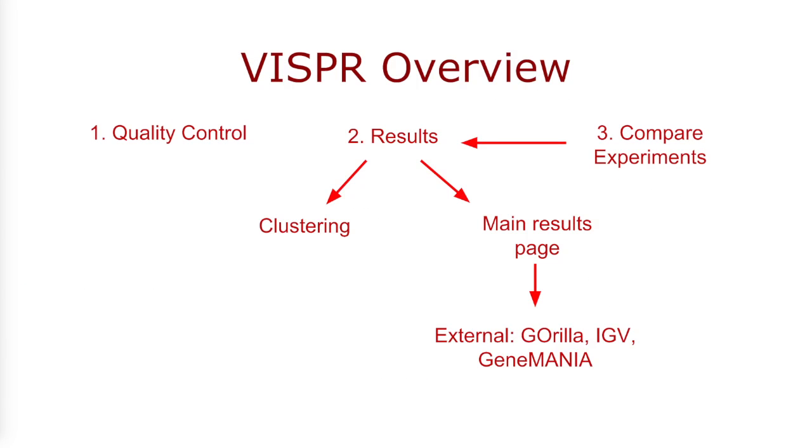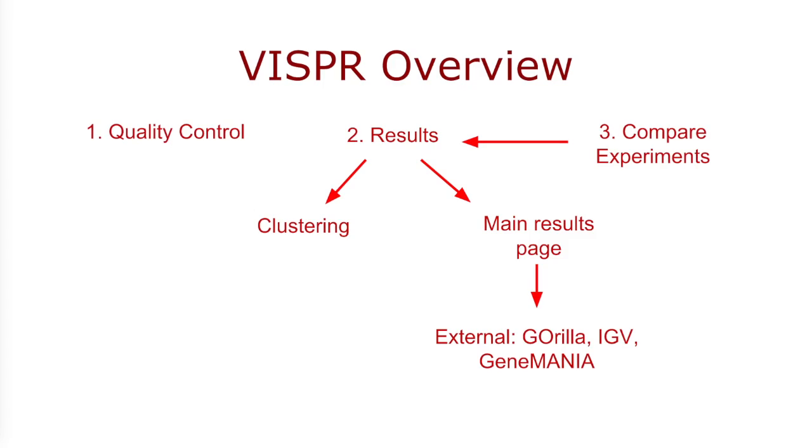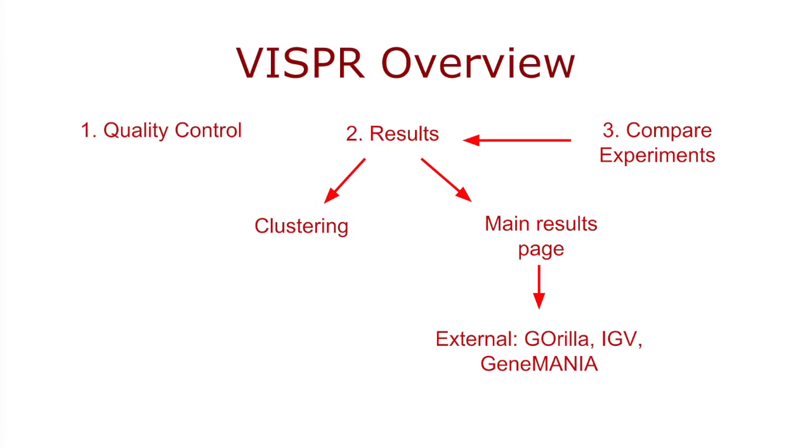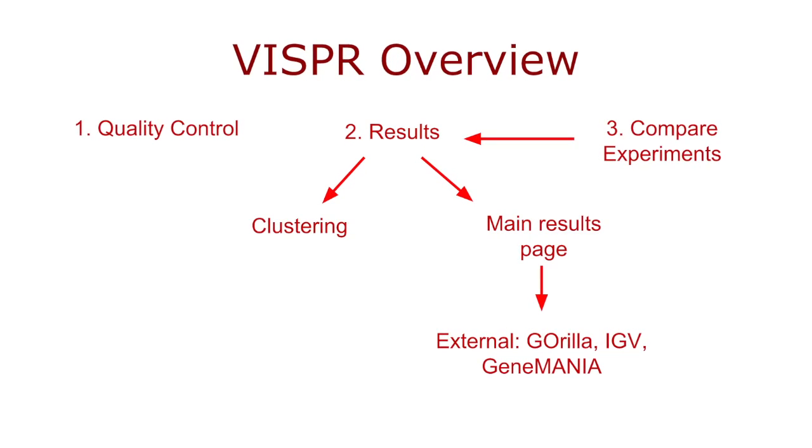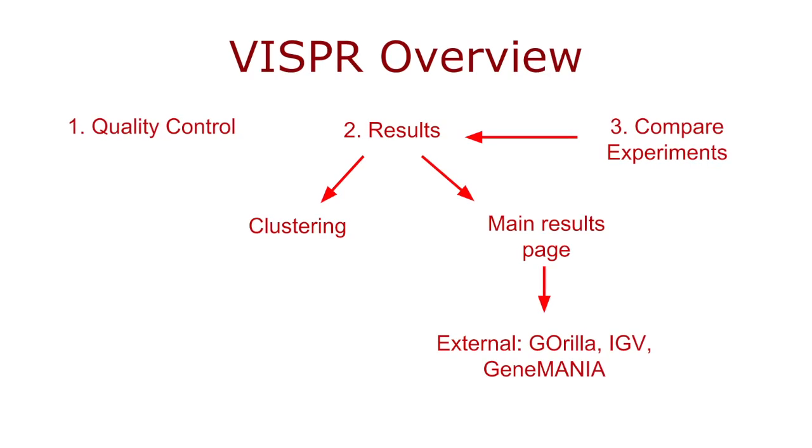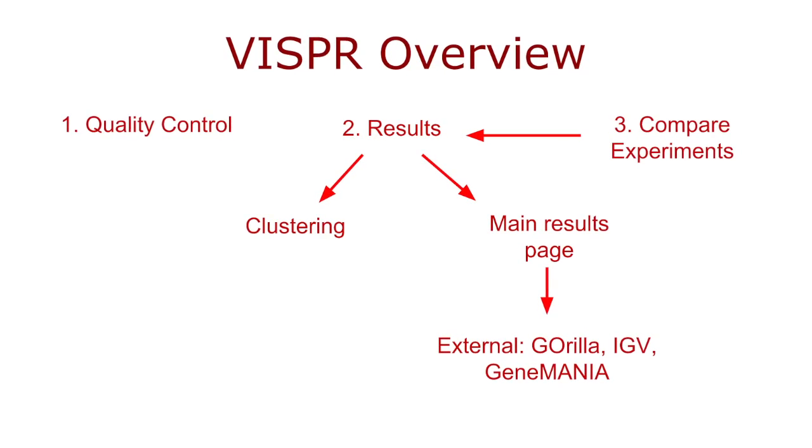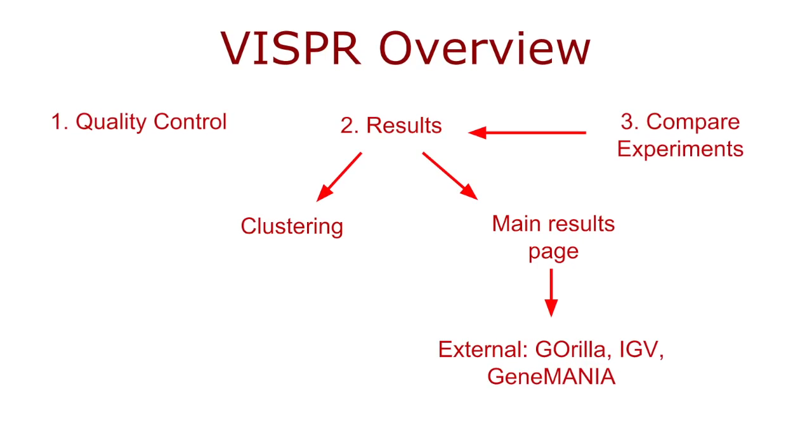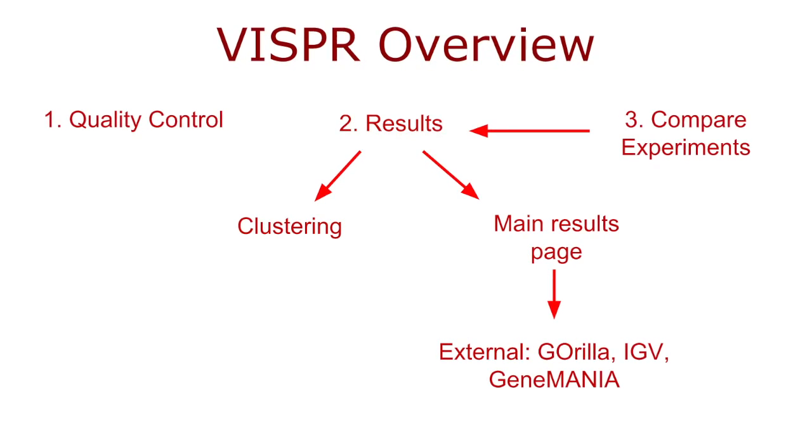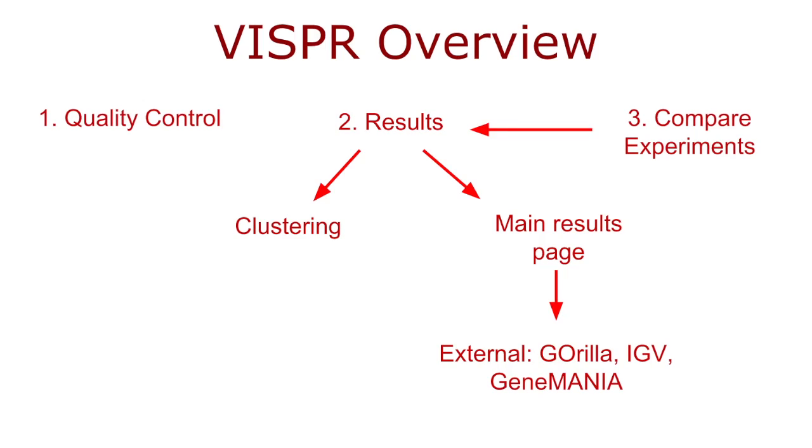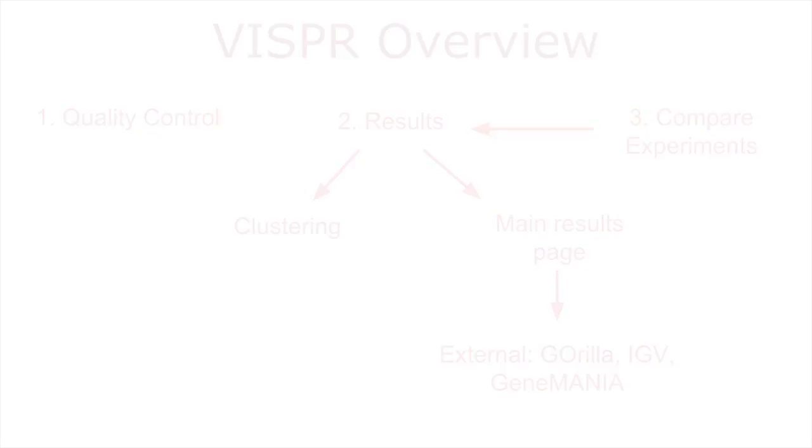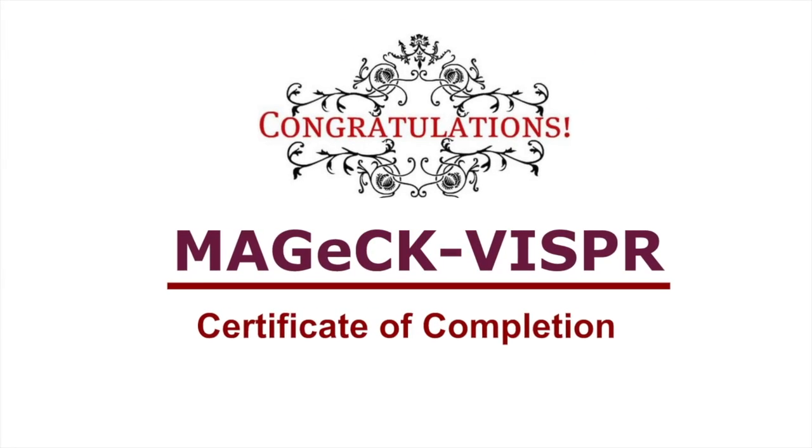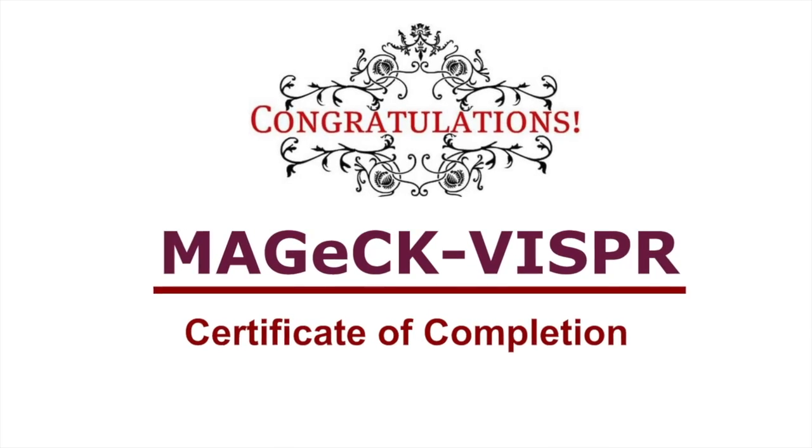And that's it! You now know how to use Visper's internal and external features to explore the results of CRISPR Cas9 screening data within experiments and between experiments. For more information on results, Magic Visper or the third-party applications incorporated in Visper, please visit the links in the video description below. If you've watched all of the preceding videos, you have now mastered Magic Visper and are ready to apply it to your own real data.